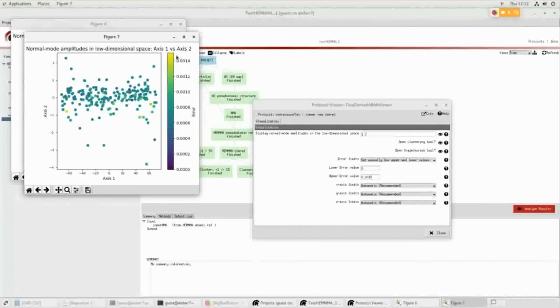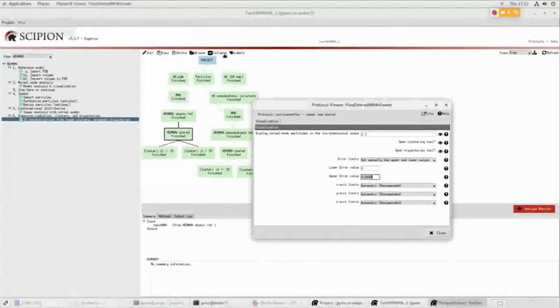You will see that this changed. It starts with 0. This is useful if you want to compare different plots, and the same you can get for x, y, and z limits.